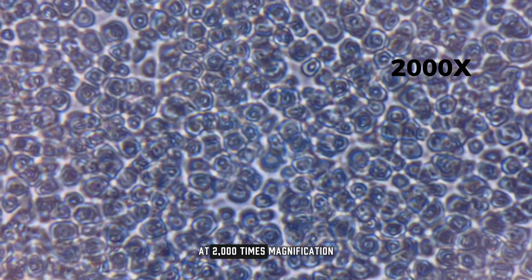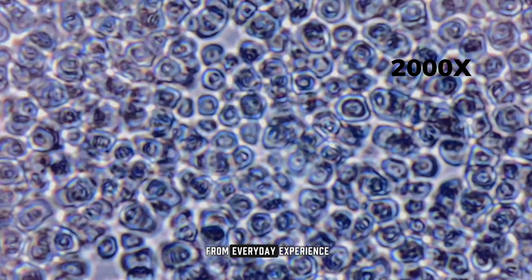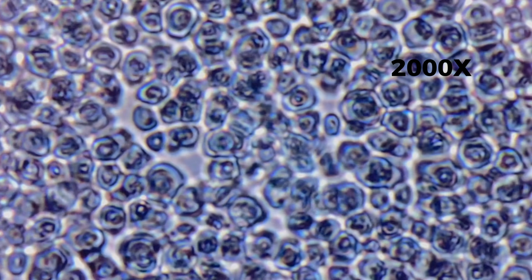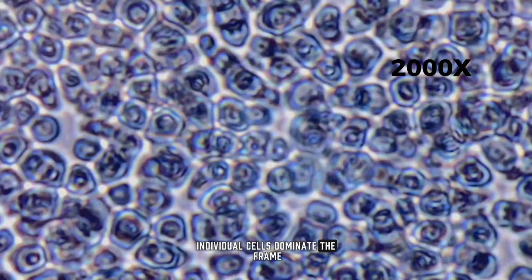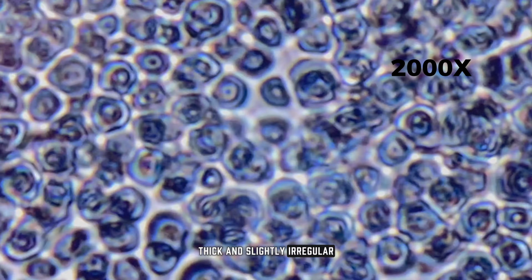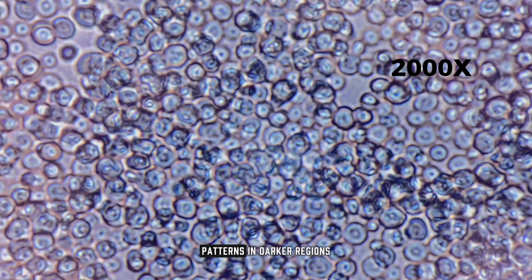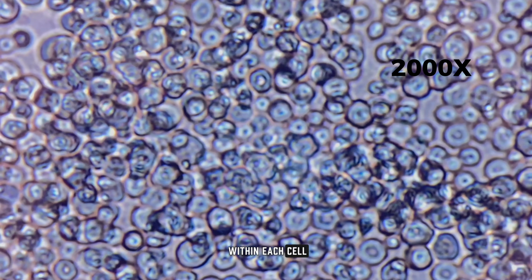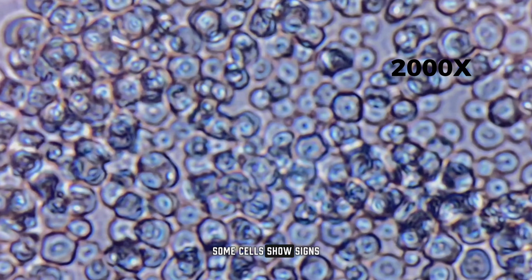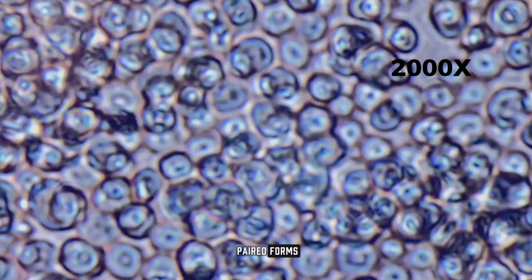At 2,000 times magnification, yeast becomes fully abstracted from everyday experience. Individual cells dominate the frame. Their walls are clearly defined, thick, and slightly irregular. Internal structures appear as layered patterns in darker regions within each cell. Some cells show signs of division with subtle indentations or paired forms.